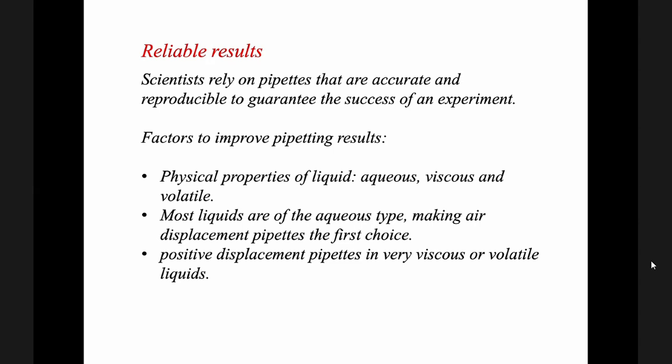Like the physical properties of the liquid. So for aqueous samples, you can use the air displacement pipette, while for viscous and volatile samples, use positive displacement pipettes. Most liquids are of the aqueous type, making air displacement pipettes the first choice. Positive displacement pipettes are for very viscous or volatile liquids.